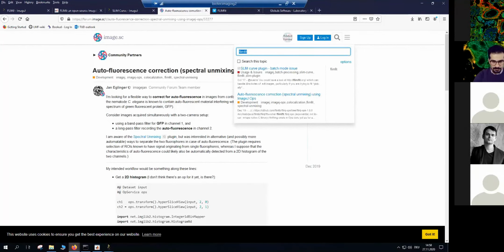I just stopped sharing. That was all. And let's see, where is the chat? So we have something in the chat. Okay. Perfect. Thank you, Daniel. Yeah. So there is a link to the Jupyter notebook that Daniel Weiger has shared. So I would suggest that you go through that and look at it. It's a nice way to showcase how the software or the plugins are working.